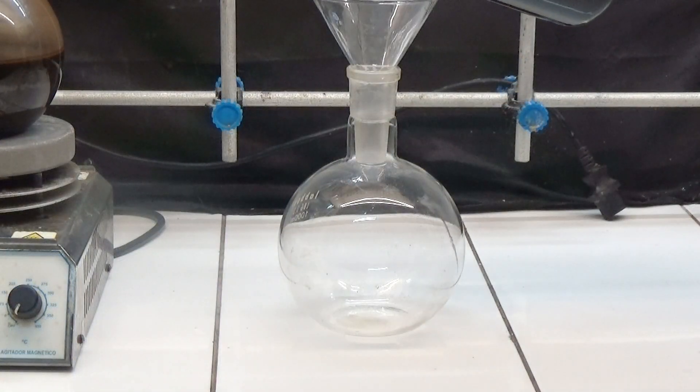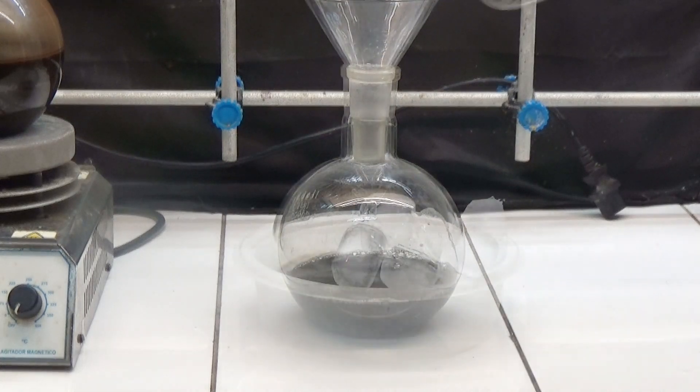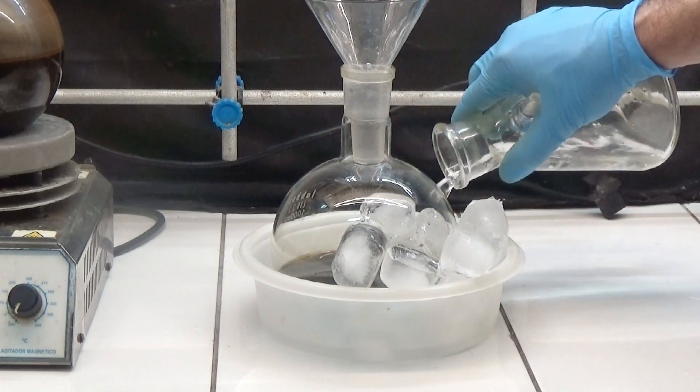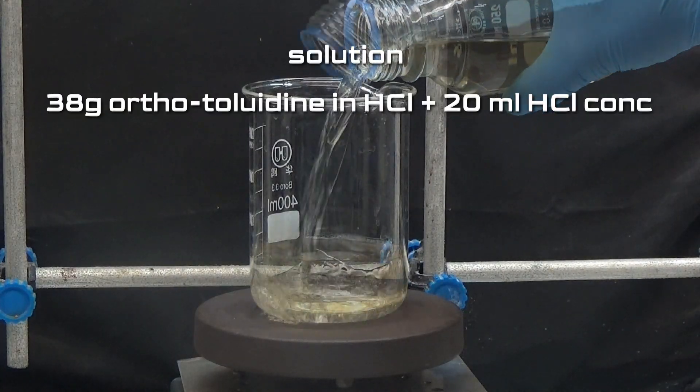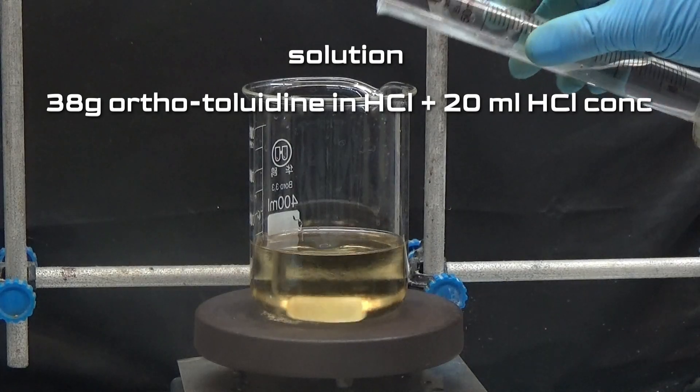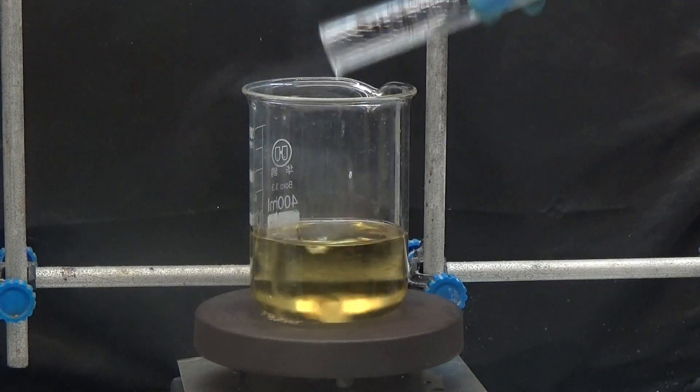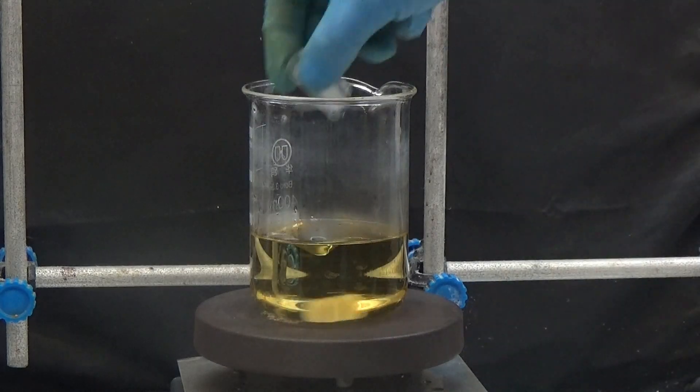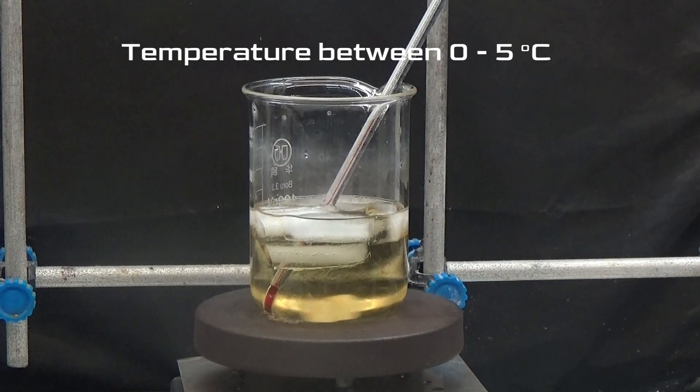We put this solution in a 1000 milliliters flask and cool it with an ice bath. The obtained solution of orthotoluidine hydrochloride from the reduction is put into a 500 milliliters beaker and 20 milliliters of concentrated hydrochloric acid is added. Add ice to the solution to cool the solution to a temperature between 0 and 5 degrees.